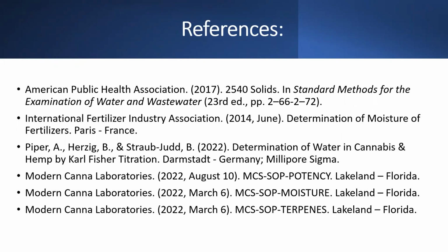Is there a formula that can be used to show the correlation between the moisture determined with a moisture balance and the moisture your laboratory is obtaining?